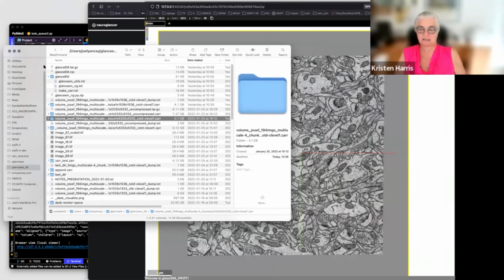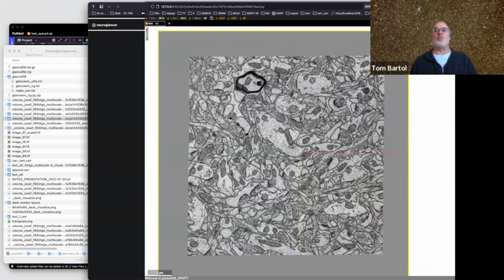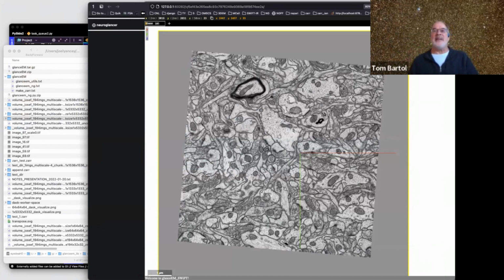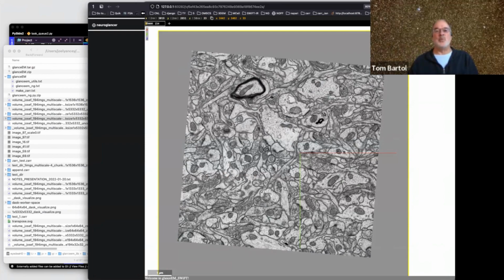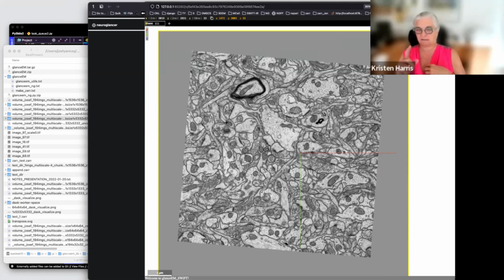That turns out to be a very useful tool when you're learning or trying to interpret complicated images. You don't want to keep going forward or back. You want to flicker between two that are in memory. Exactly, as though you were blending them, but you have two ways to look at them. One is blend and one is flicker. By flicker, I mean if you hold it down, it flickers fast, faster and faster. If you press it once and again, it goes back and forth between those two images at the pace that you hit it.